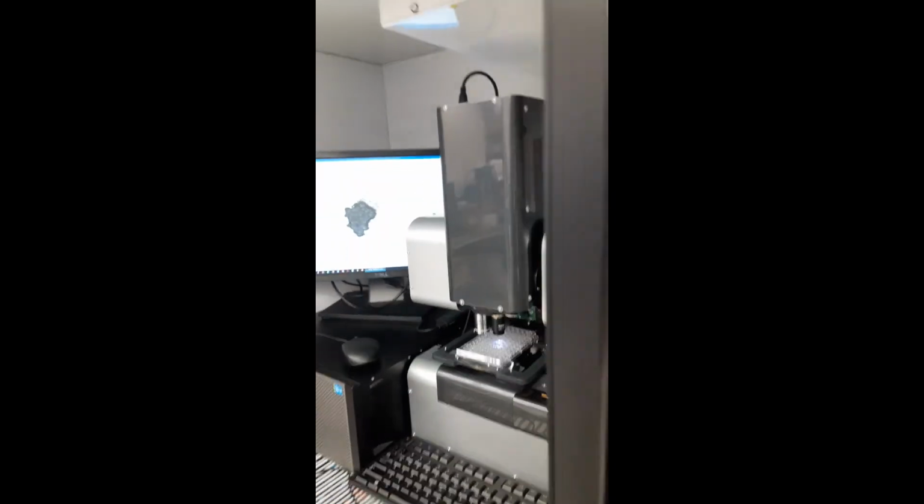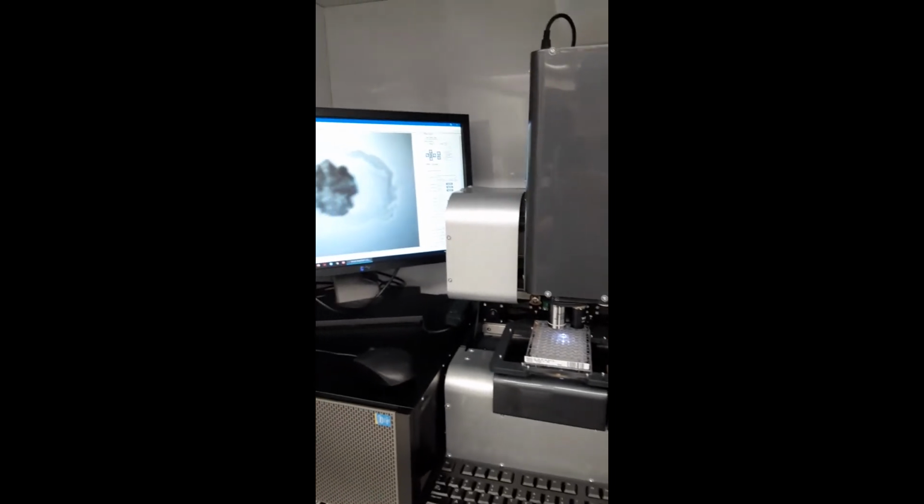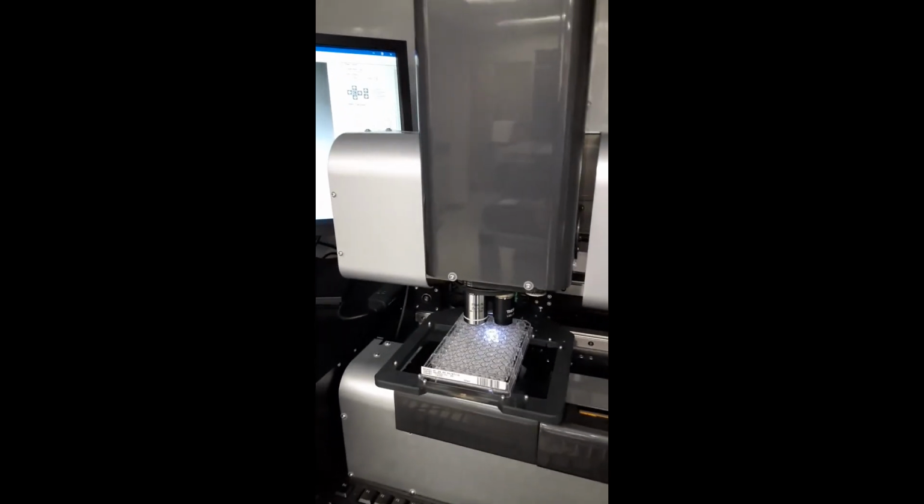So in addition to and complementary to our Rock Imager 1000, we also have a second imager, an RI1, which is an imager that is stored in a 4-degree cold box in the X-ray core. The functionality is essentially the same, except that it does not allow you to do scheduled imaging, as it only holds one plate at a time on the imager. It has visible and UV. What you would do is store your plates in the 4-degree cold box with the barcodes made by Rockmaker, and then once per day or whenever you like, come down, place them on the imager, and image the plate.